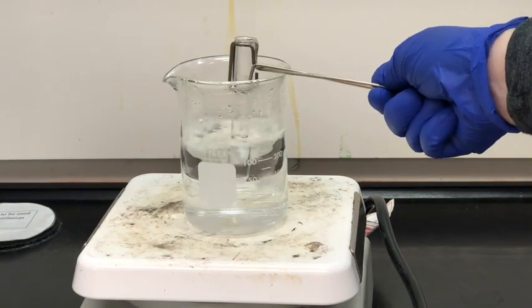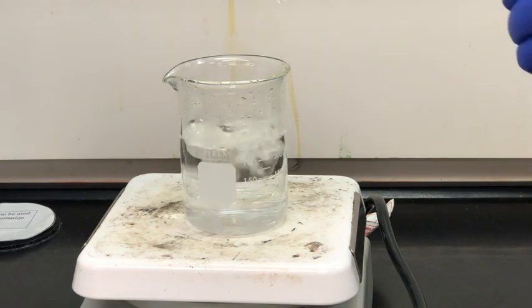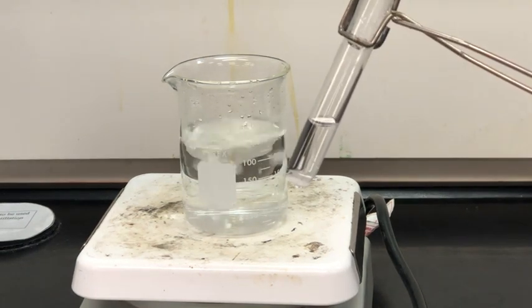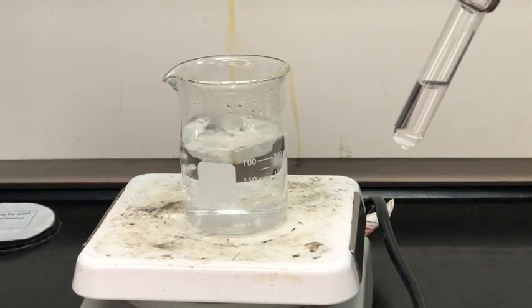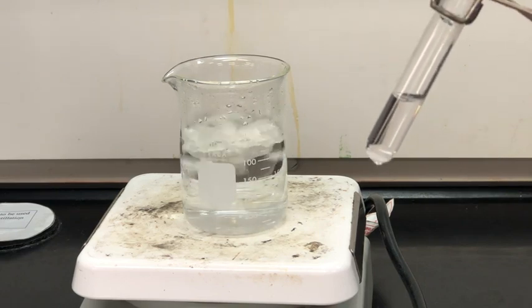After about five minutes we can see that the solid at the bottom of the test tube has mostly dissolved. There is a little bit at the bottom but that could be our sand, which is not soluble in water.